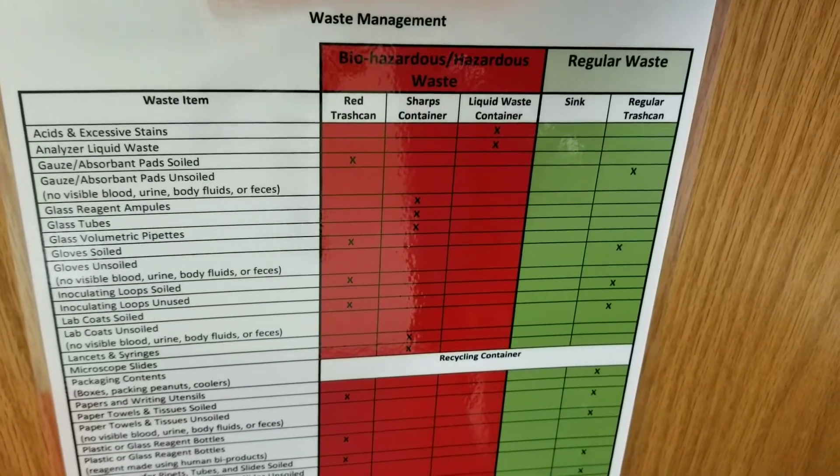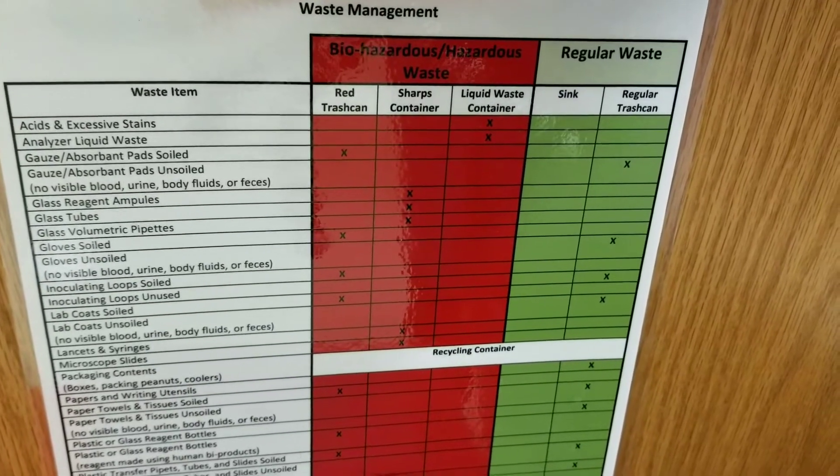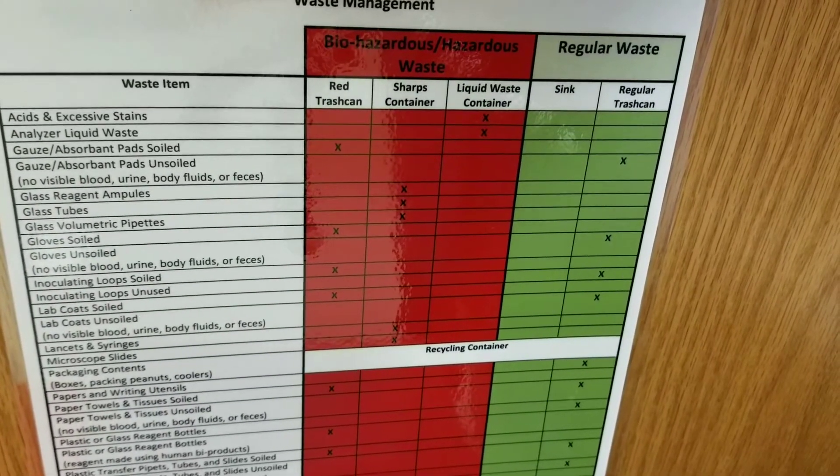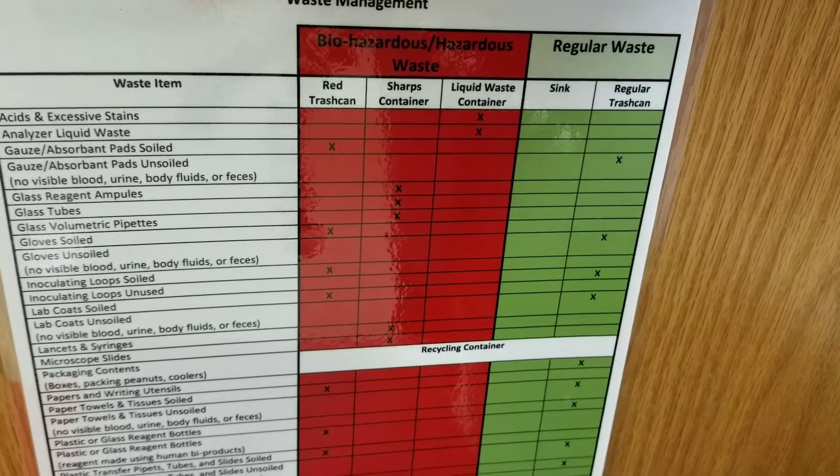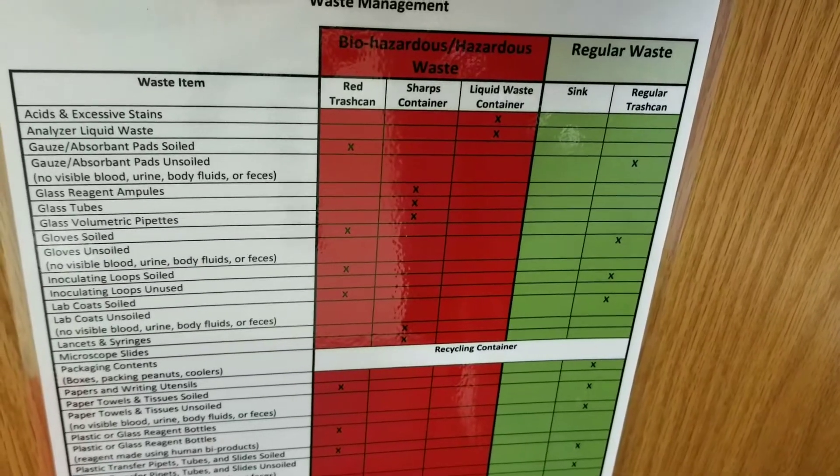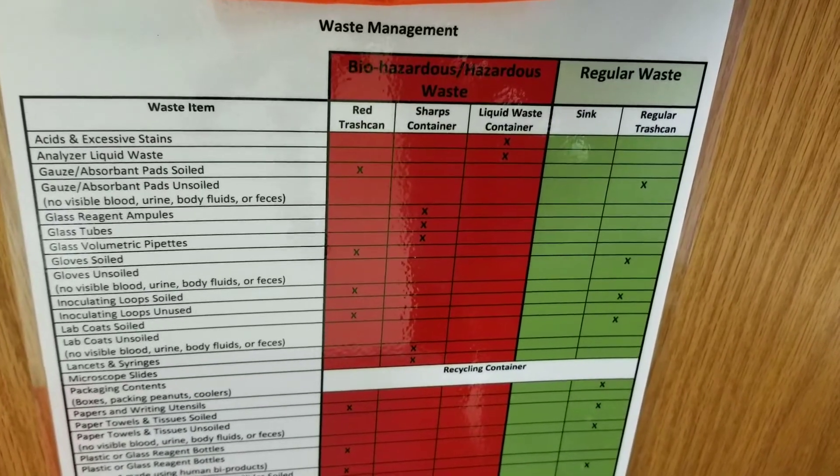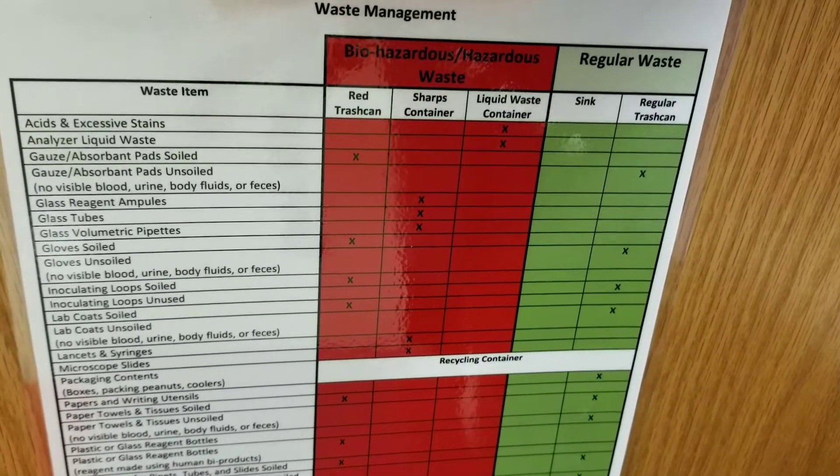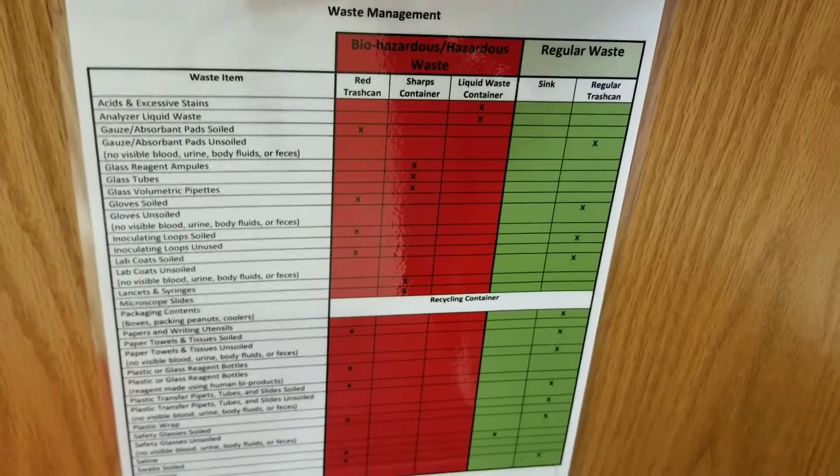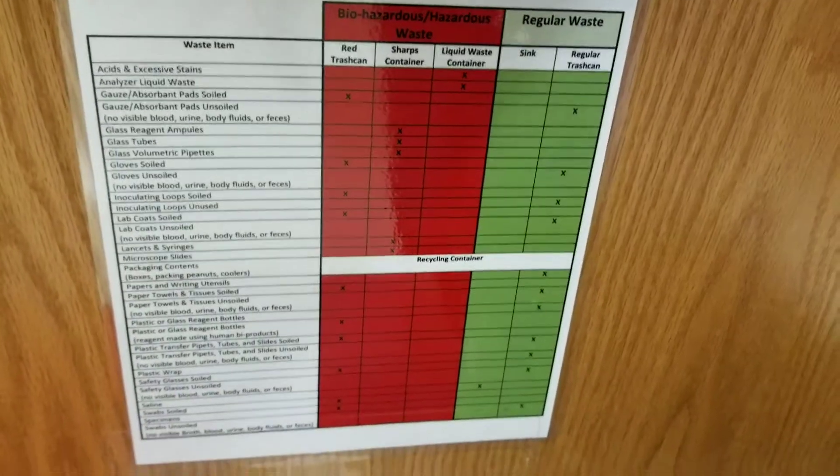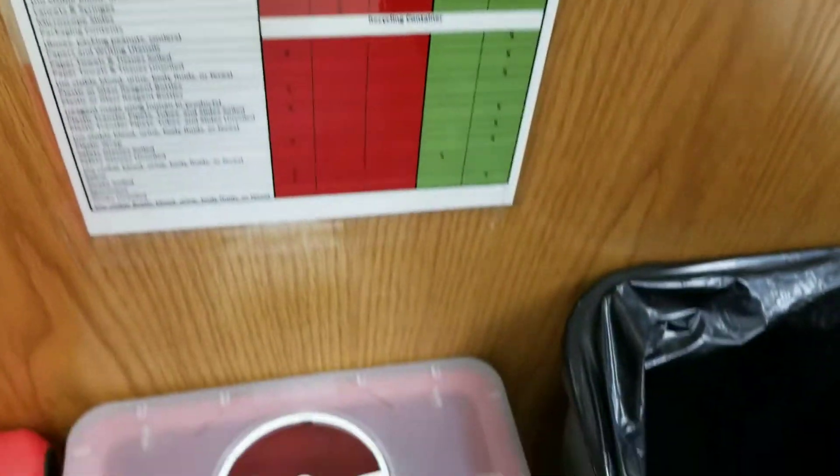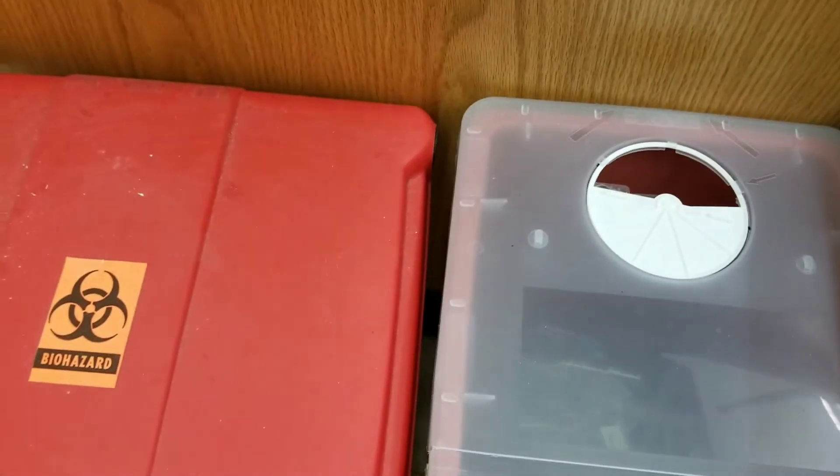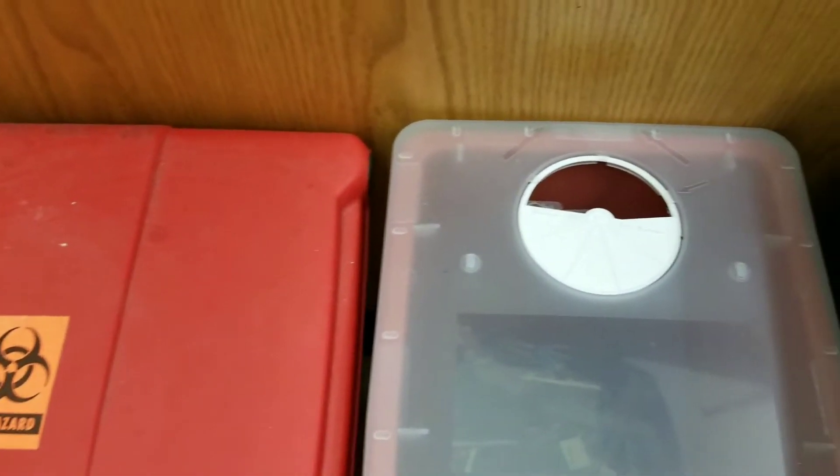Safety is of utmost importance and that is true in the healthcare field no matter what you're doing, and also includes class. So we have these wonderful charts posted everywhere and they are around bins in which you would be throwing away your waste.